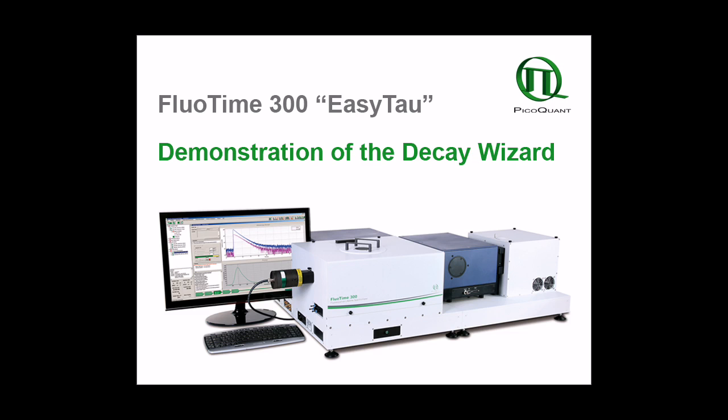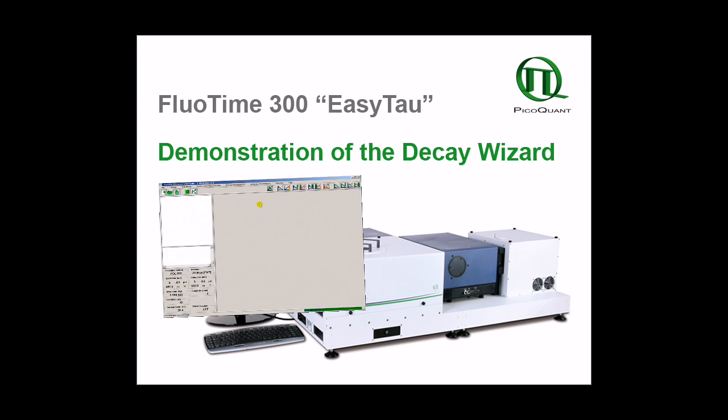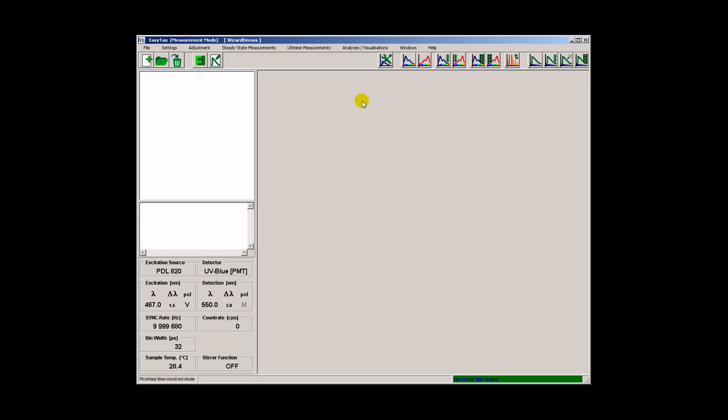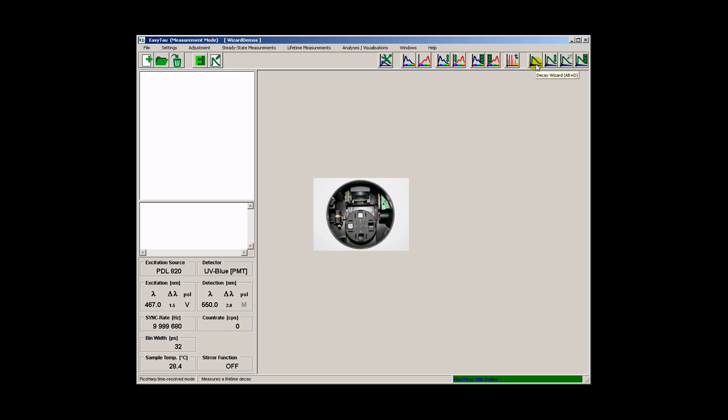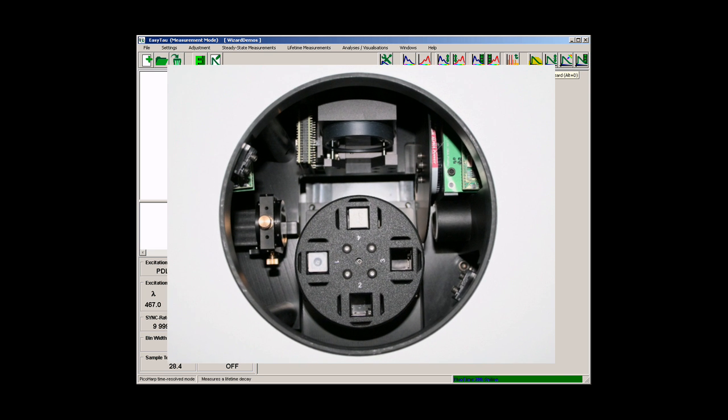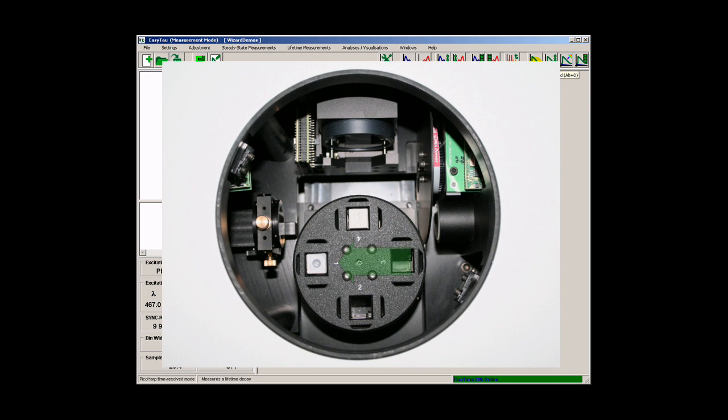This is an example of a fluorescence decay time measurement. I'm going to use one of the EasyTau wizards. I'm using the FluorTime 300 spectrometer and my sample changer is already loaded with the sample and with a cuvette with Ludox solution.